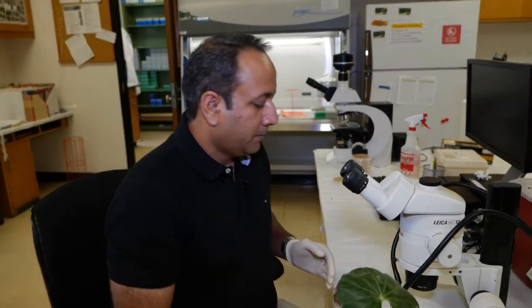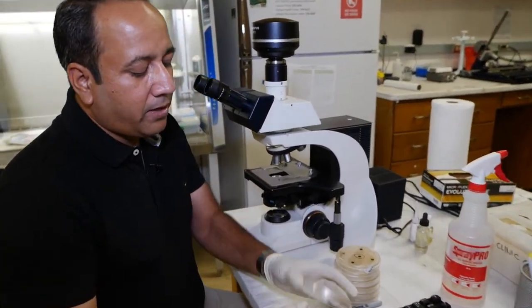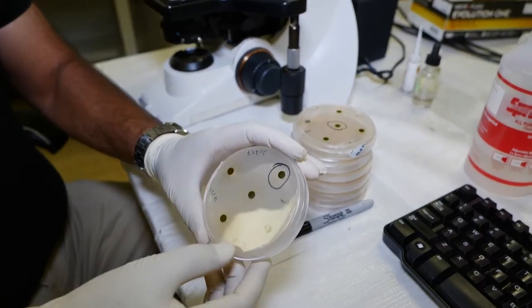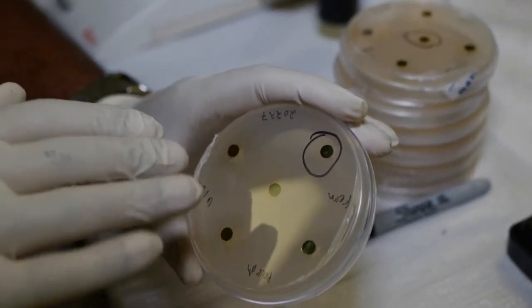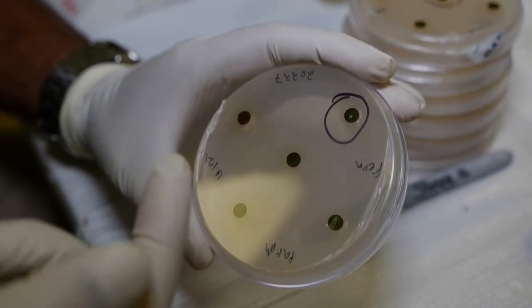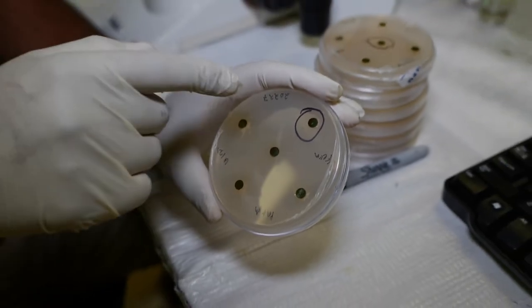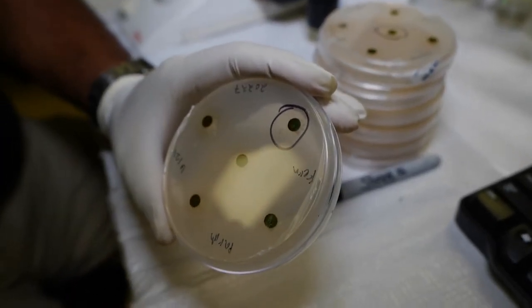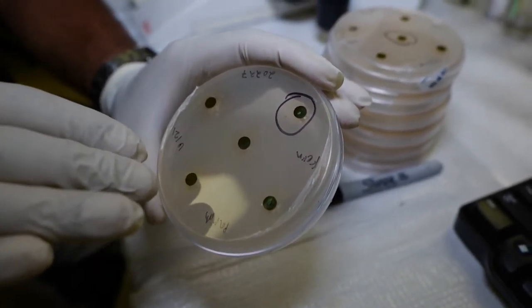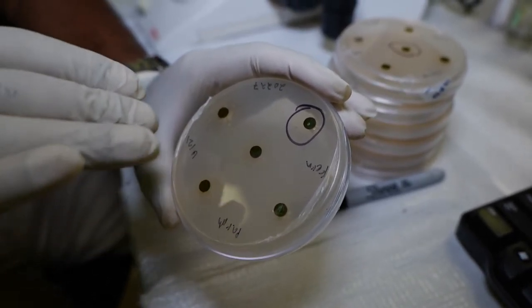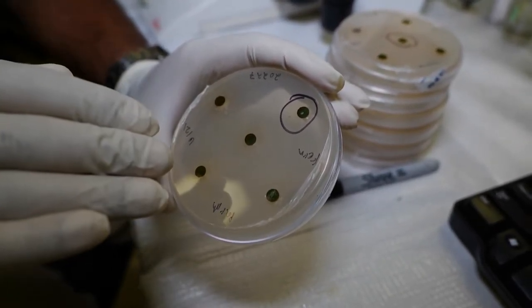Once we have them on the artificial media—this is just a plate showing a plant where the roots and soil was baited with these camellia discs. The pathogen, if it's present, will swim up and colonize the leaf discs. We'll take those leaf discs out, rinse them with water, and then stick it underneath the media. This media has all the antibiotics and chemicals in it, so it will only let that phytophthora produce into the culture.